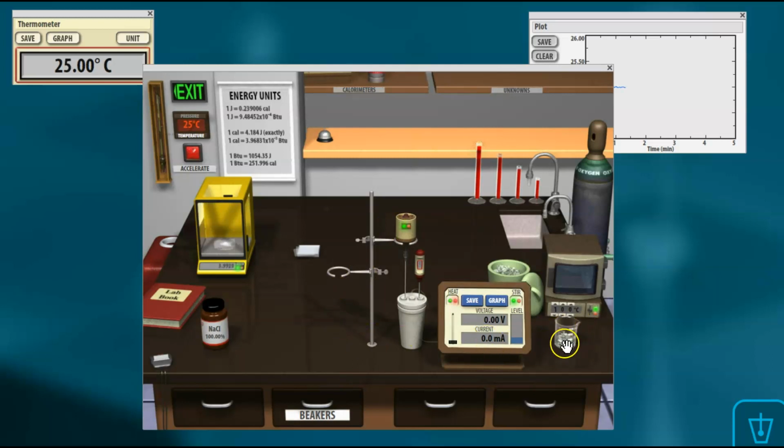It's right here. Okay. Now, for example, if you want to pour it, you grab it, press it. Okay. When it shows something like this, it means it's ready to pour. Right. And then you can accelerate. This is accelerate, make it go faster. You can see that it's changed really fast.